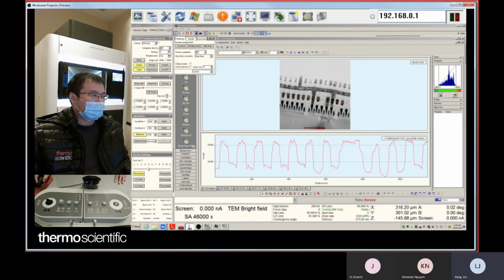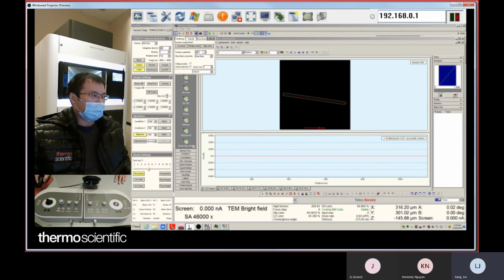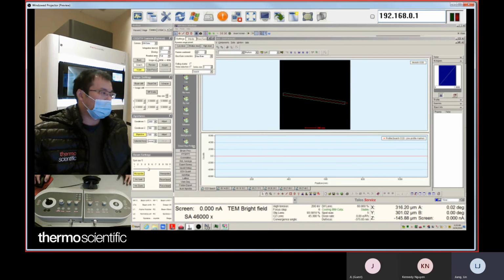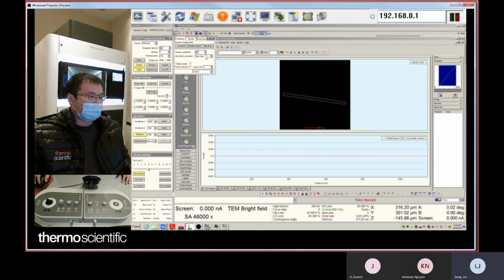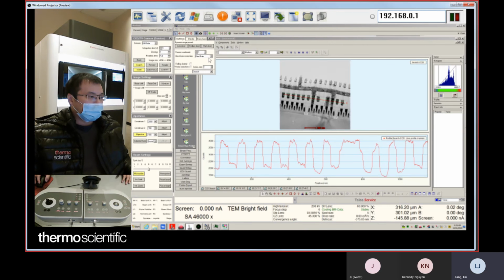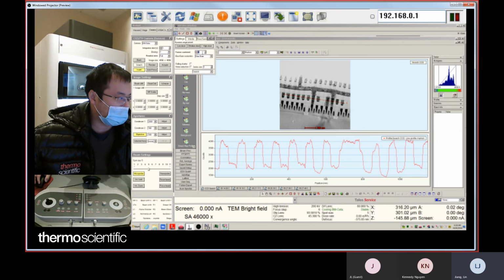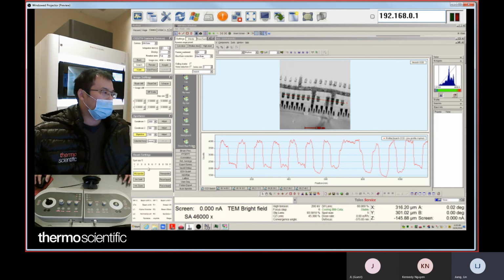Another way, you can still use binning 1, but use more frame combining. So frame 1, binning 1, you get 4,000, and you can go for 4 frames and 4 seconds.